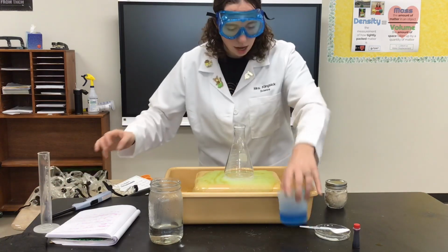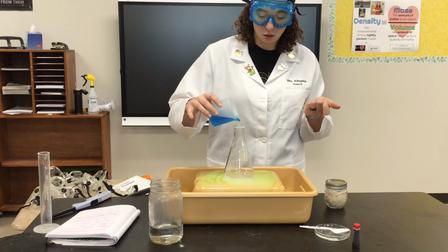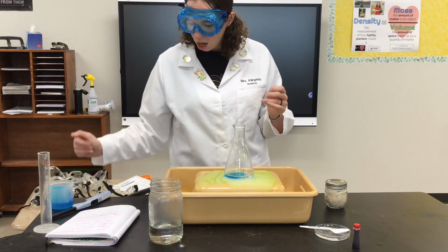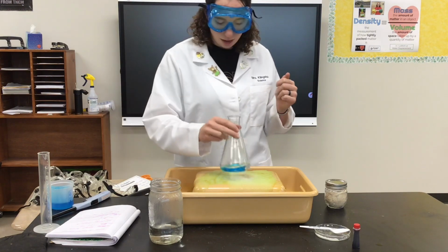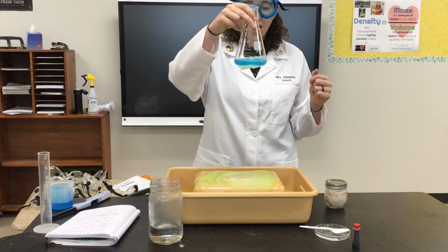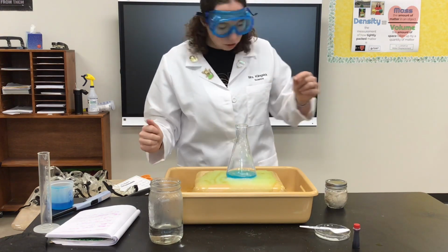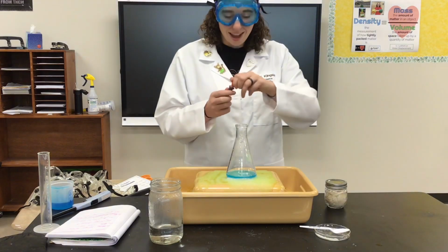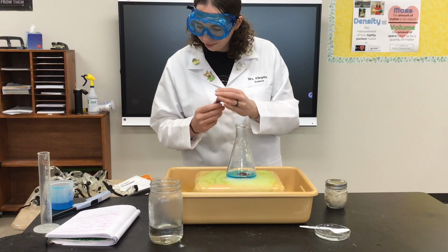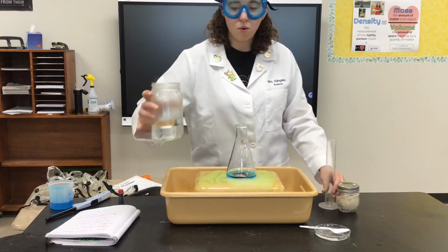And then I'm gonna be adding in some liquid soap. This is stuff like Dawn, or stuff that you would use to wash your dishes. So I'm gonna add some in, about 2 tablespoons, kind of eyeball it. And then I'm gonna swirl it around. Now if you notice, I don't really have any chemical changes happening. I'm just making those two into a solution, mixing them together. What I'm gonna now do is add some food coloring. I'm gonna go with red. Okay. I'm now gonna add in 20 milliliters of warm water.